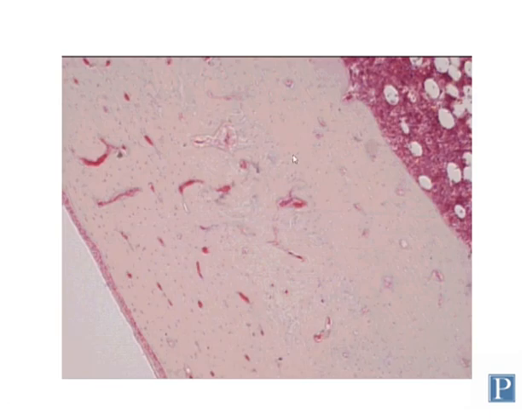So here's a higher magnification view of the outside portion of this long bone. Again, here's the marrow cavity seen at a higher magnification. All of these red cells that you see here that are densely packed in there, those are red blood cells or erythrocytes, so there are lots of those. These large white cells are adipocytes. We're going to come back and take a closer look at this later on when we talk about blood and show you some more specific cell types that can be found in here.